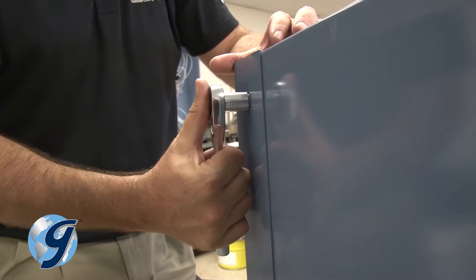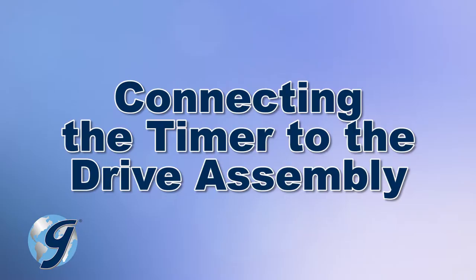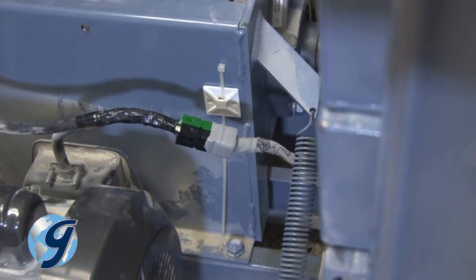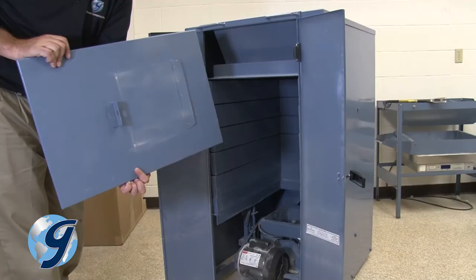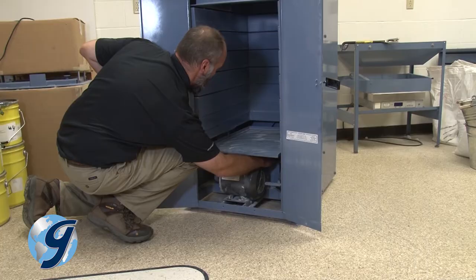Next, reattach the top panel with its attached hopper assembly. Now the connection between the timer and the unit should be reassembled. Ready a wire tie. Plug the timer into the unit, noting the green sections of the connection plug into each other. Completely wrap the connection with electrical tape — the electrical tape protects the connection from excess exposure to materials being tested. Secure the connection with the wire tie. Now reattach the protective drive case cover by sliding it into position and screwing it into the unit. The screw hole is located under the drive case cover, centered and towards the back.